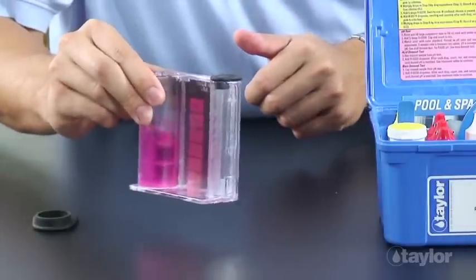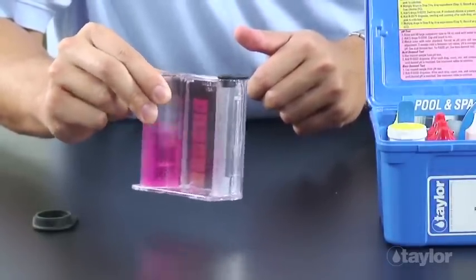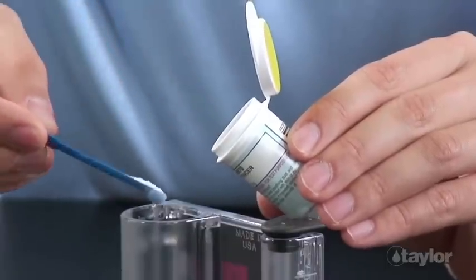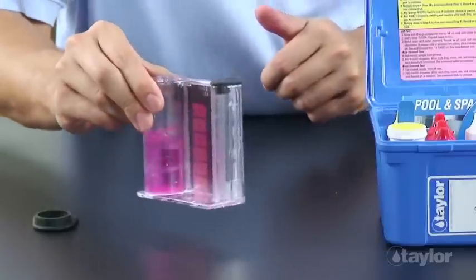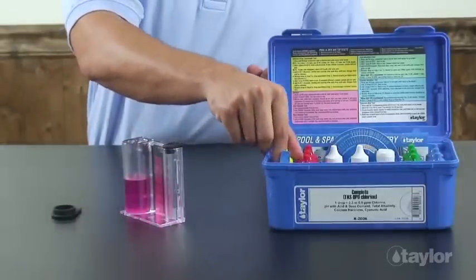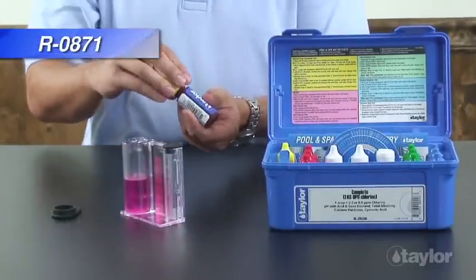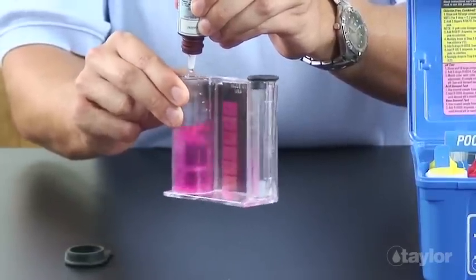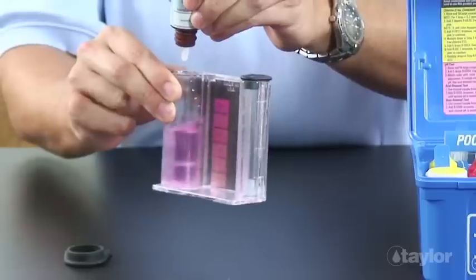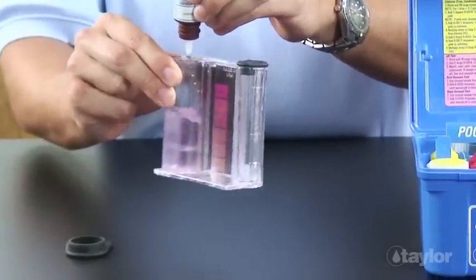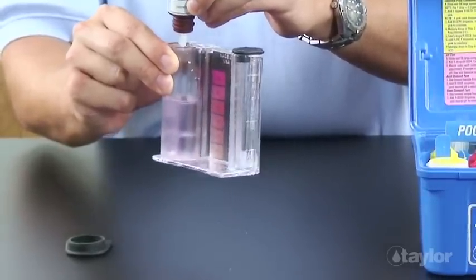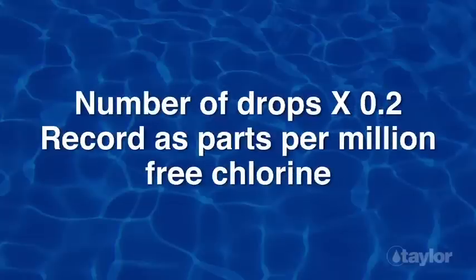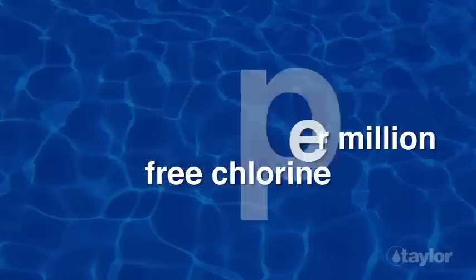Swirl until all the powder dissolves. If free chlorine is present, the sample will turn pink. If the pink color disappears, continue adding the DPD powder a dipper at a time, mixing between additions until the sample turns pink again. Add reagent 871 for chlorine drop-wise, swirling and counting after each drop until the sample goes from pink to colorless. Multiply the drops needed to make the color change by 0.2 and record the result as parts per million free chlorine.